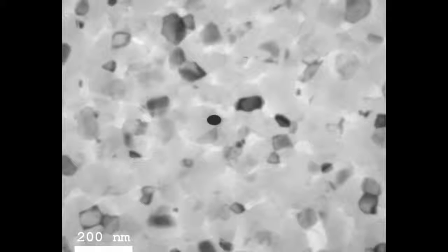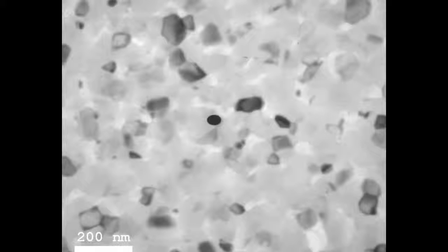Here we have the bright field imaging view of the transmission electron microscope. And what we see here is a sputtered aluminum sample. And that means that everything on screen here is aluminum of equal thickness. The contrast that we see, these small grains, that is aluminum crystals that are oriented in different directions.